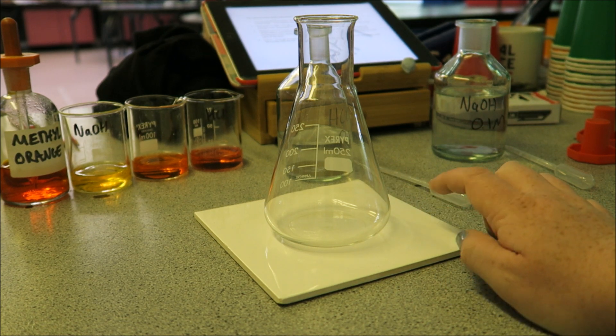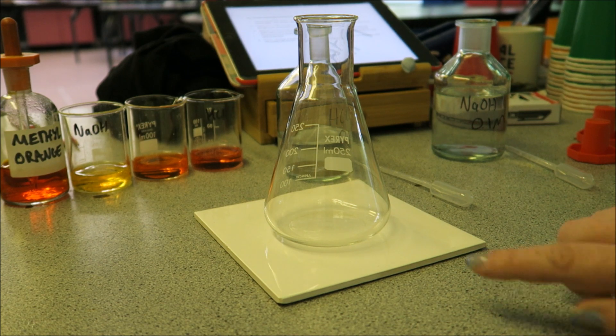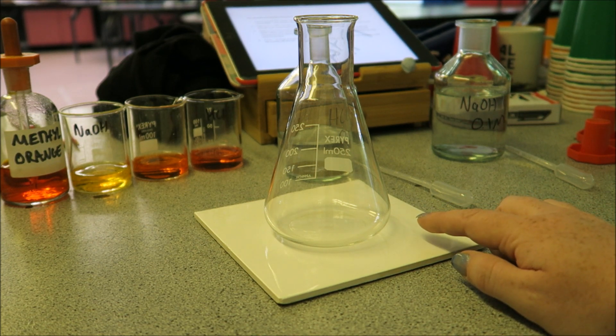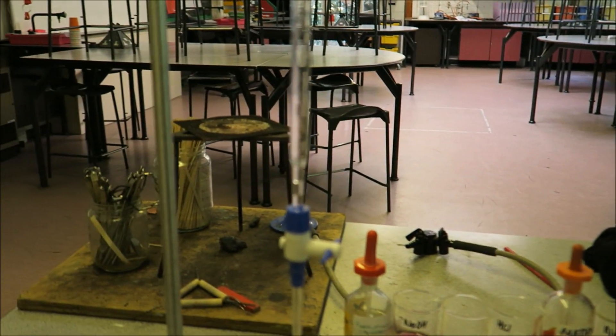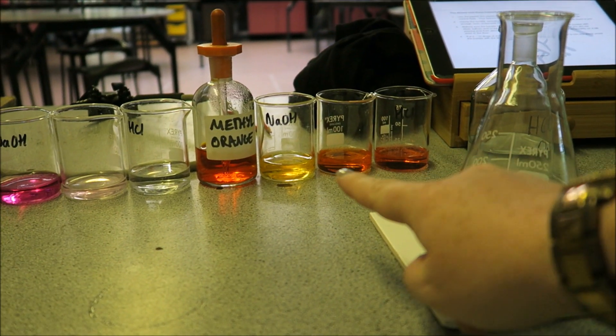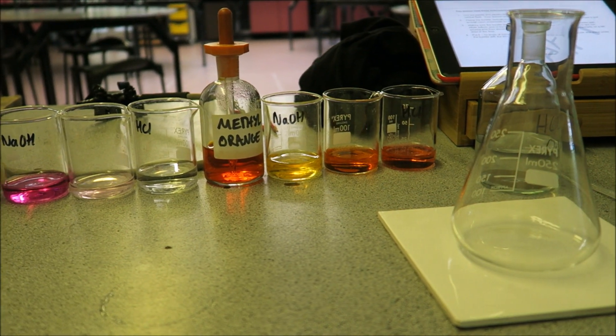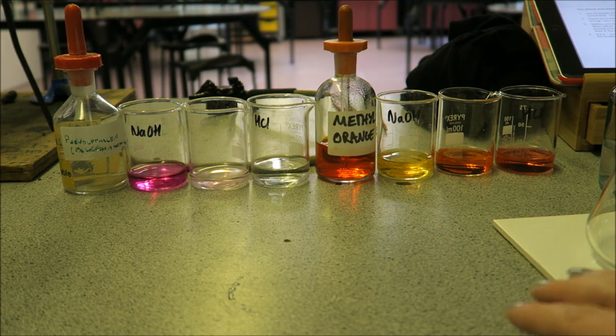Here I have my conical flask on a white tile so I can clearly see the color changes. Into this flask I'm going to be putting my sodium hydroxide. Over here I have my burette where my acid is going to be. In the background you can see the two different indicators, phenolphthalein on this side and methyl orange here.